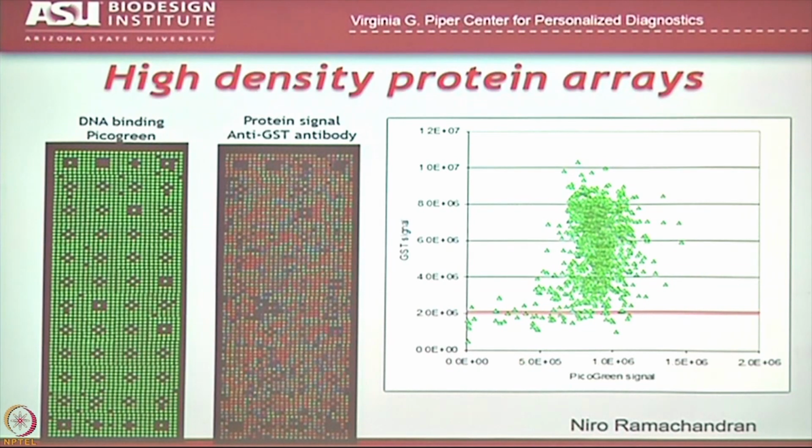Secondly, if you look from the top of the expression to the bottom of the expression, the entire range is within one order of magnitude. So instead of those protein arrays where the lowest to the highest amount of protein would span over 4 orders of magnitude, now all of our protein is within a single order of magnitude. In fact, 93% of these spots are within twofold of the mean, which means that we're getting very even levels of protein on the chip. And remember, that's one of the things we wanted from an ideal array: very consistent, even levels of protein.